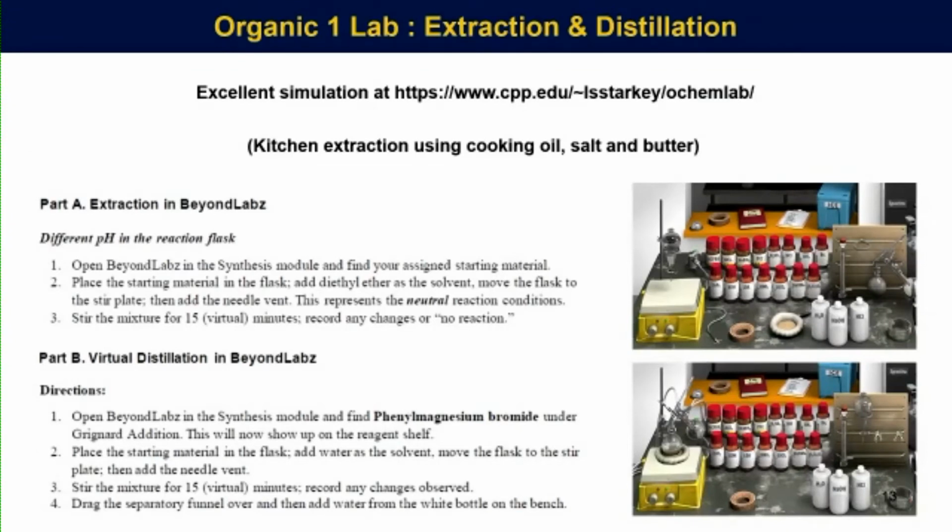We gave them some compounds to play with, and they got different compounds all mixed up, and they were to report what happened. And then for the distillation, that was fairly straightforward because we just quenched phenylmagnesium bromide from the Grignard experiment. That gave us benzene, and we distilled benzene. So you've got now this buildup, and they're used to that equipment, all in little segments without all doing it at once and getting lost. They've done this in individual segments, and now they're starting to understand what's happening.